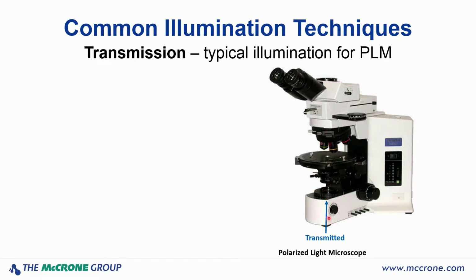One thing that people often forget is that this kind of light will change the color of some things, particularly when you have fibers. You may look at it in oblique illumination, and it's a purple fiber, and with transmitted illumination, it may be more pink, or it may be more maroon. It's going to have a color shift to it because of the way the light's transmitted through it.